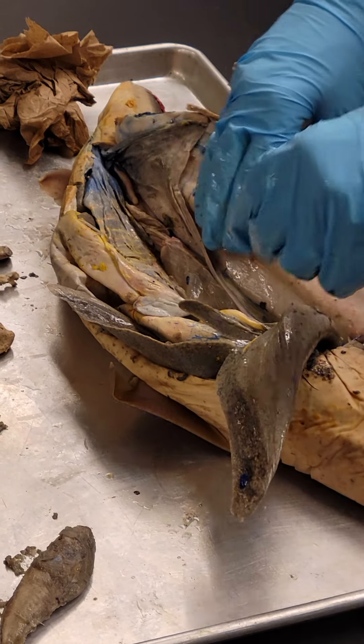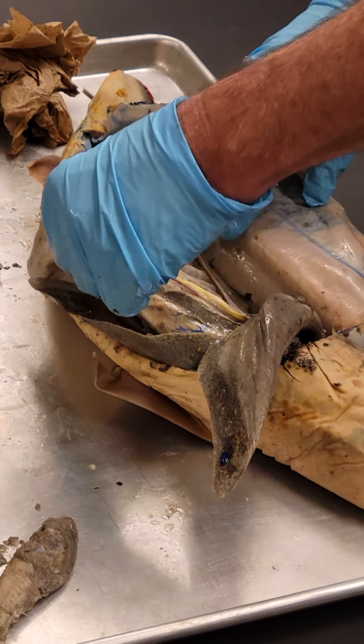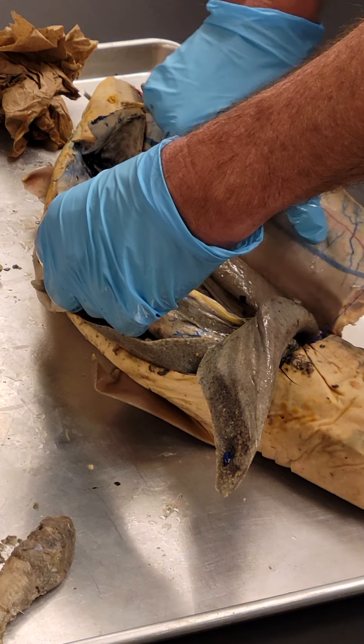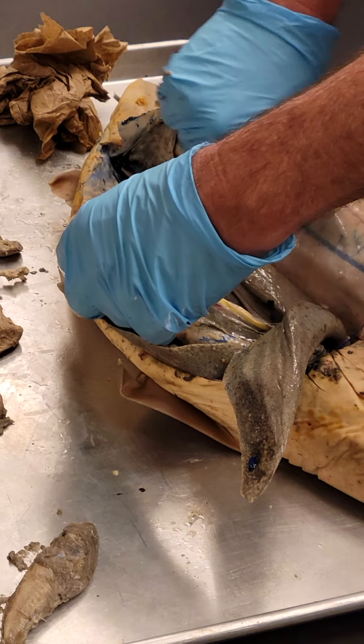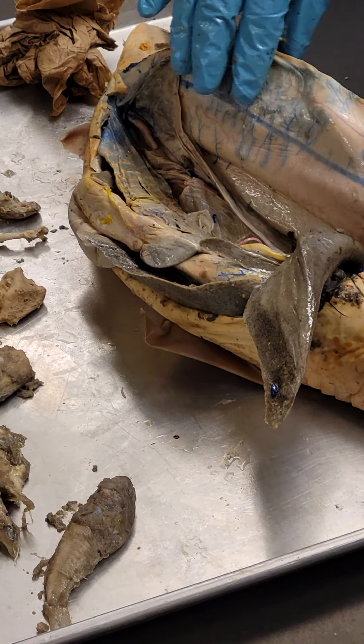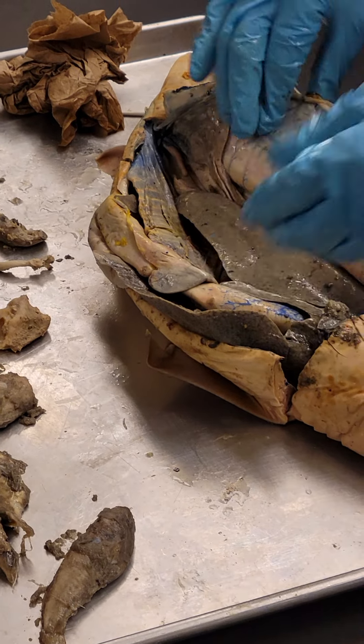Circulatory system — normally in zoology we'd spend a bunch of time on this. The basic idea is the blood from the dorsal aorta has to be sent to all the organs, so each one of these red and yellow bands are circuits that go to and from the organs. I won't make you accountable for all of that.